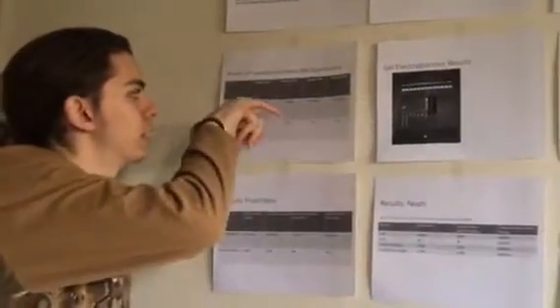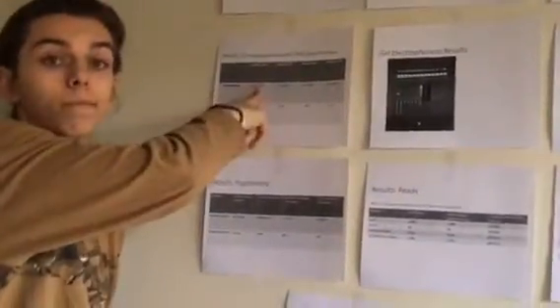For the initial DNA quantification, we used the UV spectrophotometer, and as you can see, the units were taken in nanograms per microliter, and this ranges from 6.4 nanograms per microliter all the way to 85.1 nanograms per microliter.